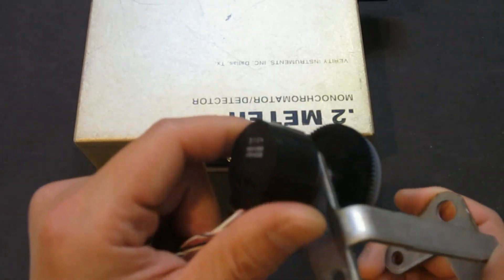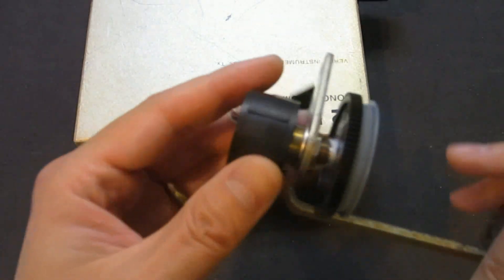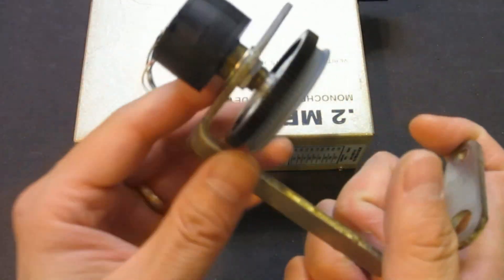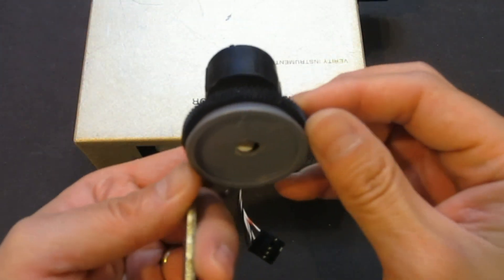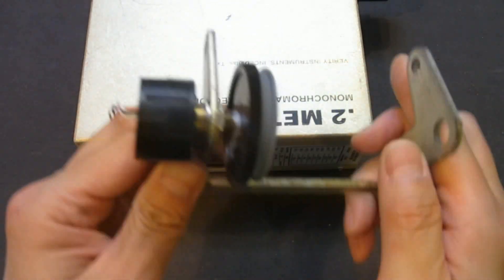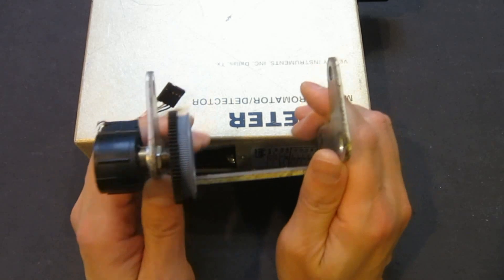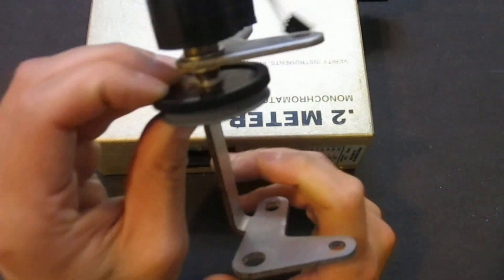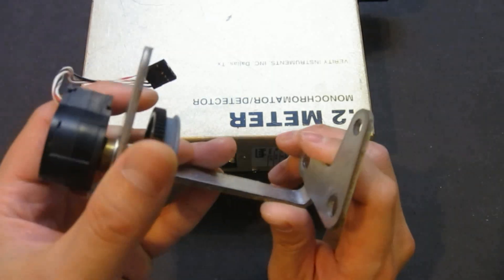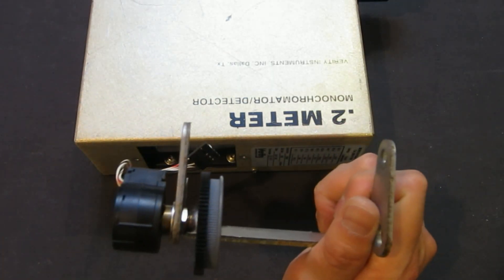I might have actually obtained it from somebody else, but I don't remember. Anyway, it's a very nice and smooth optical encoder. I had lots of these kinds of gears from various printers and stuff like that, so I glued two together very crudely so that I can put a cogwheel belt over it.